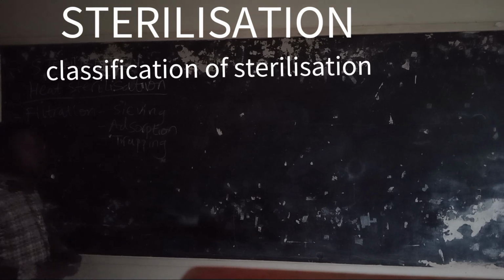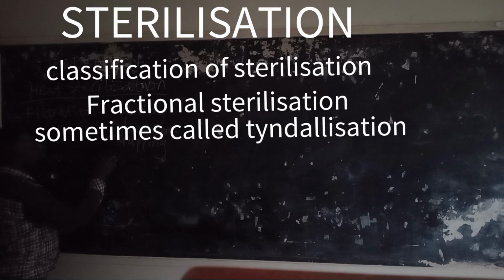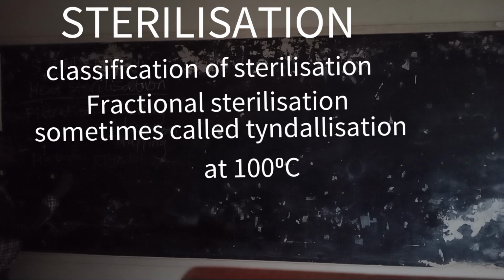We have also fractional sterilization, sometimes called Tyndallization. It is also under physical sterilization. Here, the media is sterilized at 100 degrees Celsius.